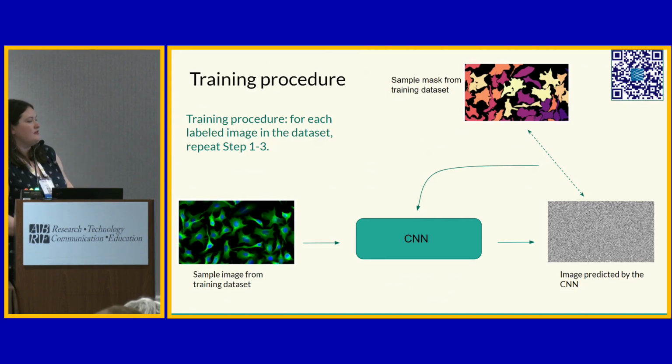And again, it's going to be exactly like the movie that I didn't show you, but I would have shown you before, which is we are going to take a sample image, stick it in a thing, see what the output is, see if it's right, compare it to the right answer, and if it's wrong, we're going to try and change things until it gets better. And we're going to do this iteratively. And this is what requires a lot of compute.